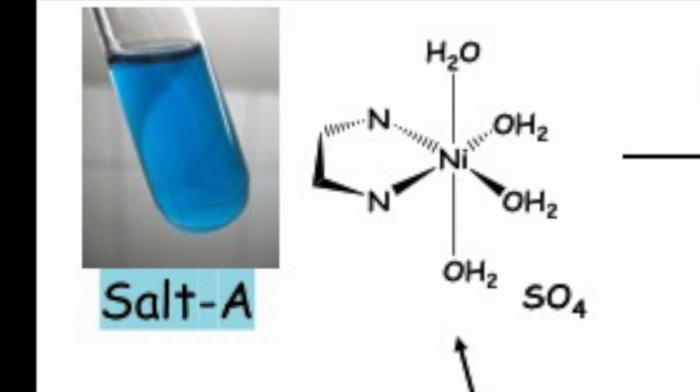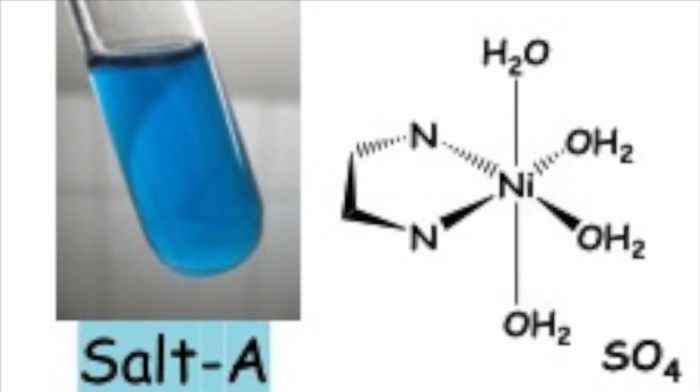You add a bunch at a time and hope for just one substitution like that. Okay, and when one of the ethylenediamine kicks out 2 of the water, then that's the salt that you get. And it looks sort of bluish. We call that salt A.